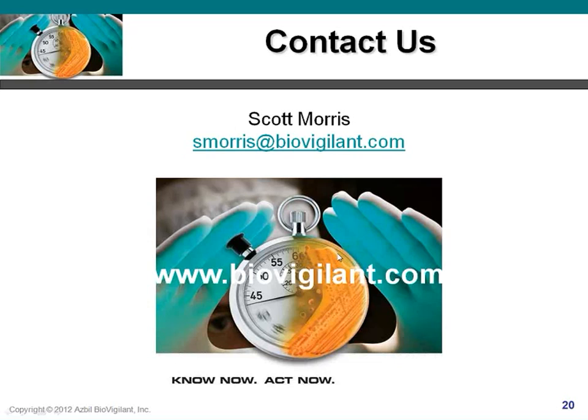How is microbial identification performed? That's a common question that we get. So microbial identification with this rapid method is not necessarily performed. It's not a genus or species identification because, as I mentioned earlier, what we're detecting is the presence of universal fluorophores, including NADH, riboflavin, and dipicolinic acid. Because those fluorophores are universal, they're nonspecific. So you're not going to be able to get a genus or a species identification. Simply the software and the instrument is going to tell you whether or not the particle is biologic or not.